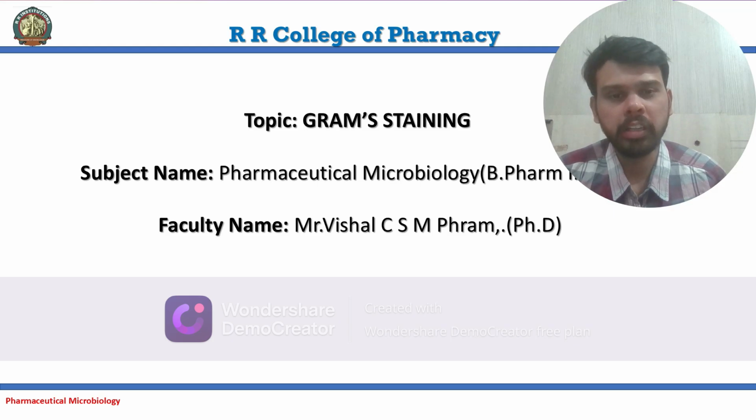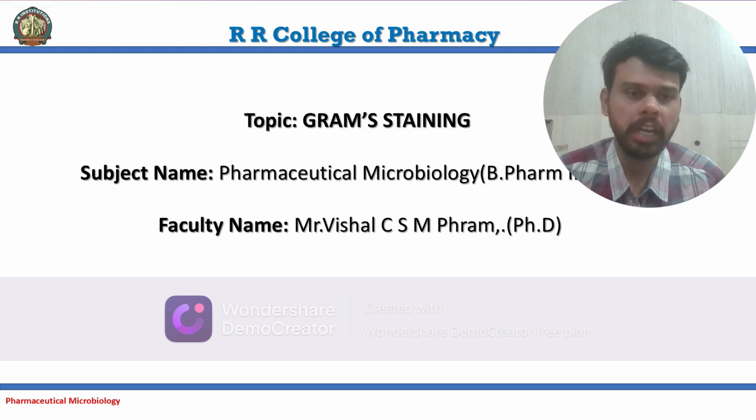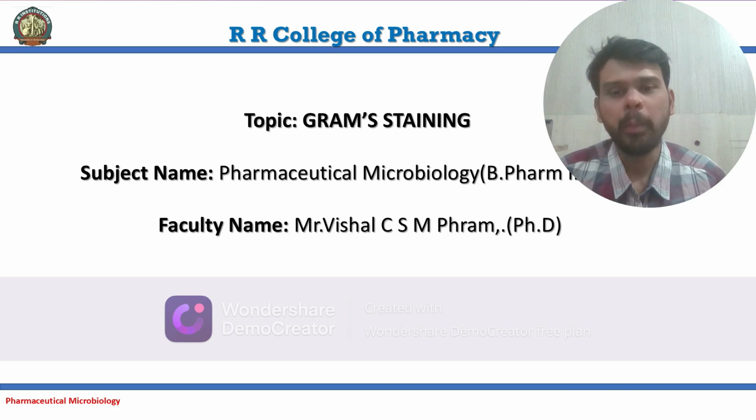Today we are going to discuss Gram staining, which is prescribed in the B Pharmacy third semester syllabus in Pharmaceutical Microbiology.